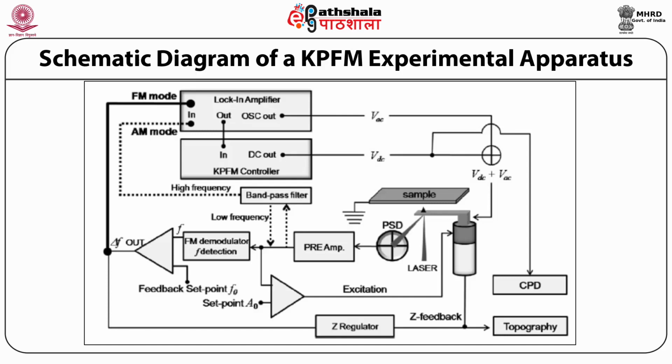The KPFM experimental setup is an AFM based apparatus. The basic operational principle and instrumentation of AFM and KPFM are reviewed together. A comparison is made between KPFM and other surface potential or work function measurement tools. Recent reports show that KPFM can be used to image potential distributions on the surface with sub-nanometer resolution, making KPFM the best technique at present for characterizing the electrical properties of nanostructures.